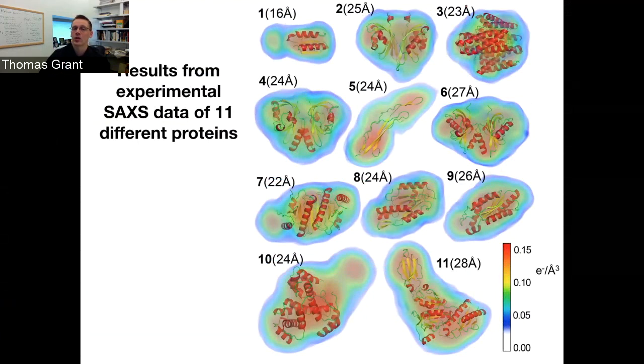In doing so, you could then use that as a restraint in your system, which is what I'm working on now, to be able to build what the rest of this actually looks like at higher resolution. Rather than building the whole thing ab initio, you could just restrain this and build this part ab initio, to try and get a better idea of either complexes or missing domains, things like that.